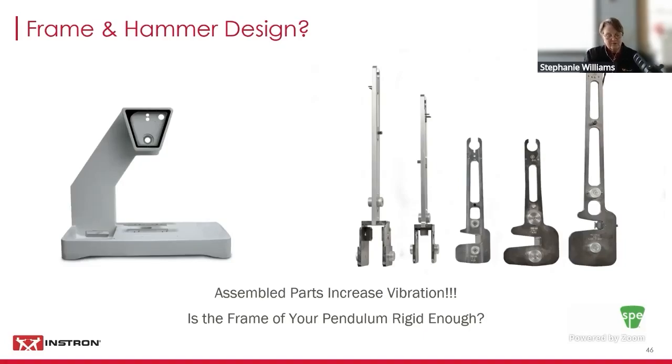ASTM, in each of its standards, usually in section 6 with Charpy and Izod, makes a definition about what the pendulum should look like. It essentially comes down to defining that it should be rigid. It should have minimal vibrations due to the construction. It also defines what the hammers should be. They should be rigid and robust, as well as the striker faces. So one of the things to consider is whether the frame itself is rigid enough. Is it going to reduce or minimize any vibration that might come into play? Because when the hammer hits the sample, there is going to be some vibration.